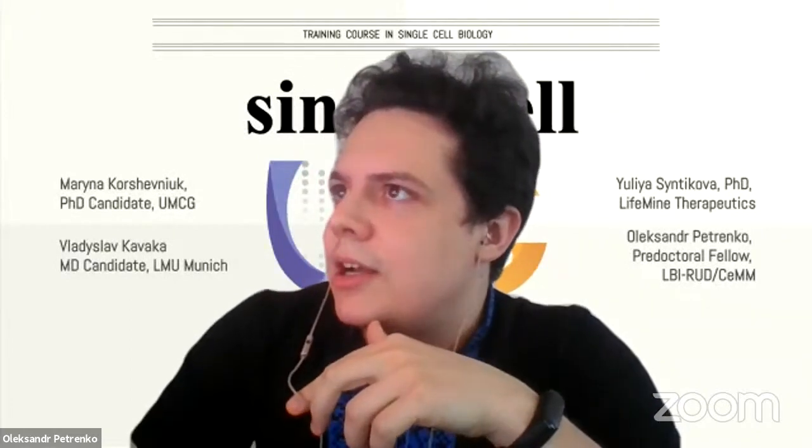Today we have actually an easy task because all of you have created different environments or are working in different settings. So first of all, for those of us who are working through the genomics cloud, there are some folks who asked for the access. So you will see the workshop main script. You should open that. And basically, if you did it, you are already here. And everything works. The second thing, and I will share my screen now to show how it looks.